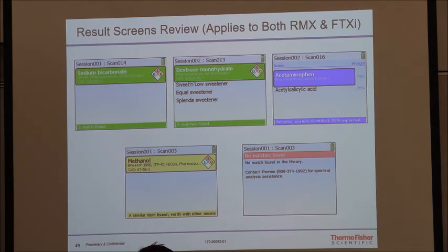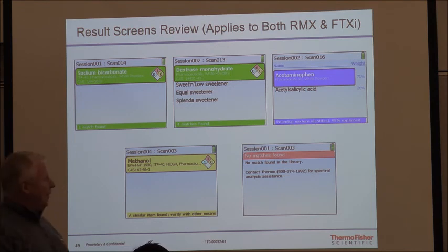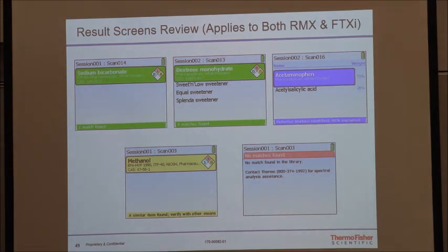Someone says, well, what's the concentration? Don't know. Don't really care. I just know it's a mix of those chemicals. Does that make sense? And I know someone's going to do it because it happens all the time. A month from now, you're going to go down range and say, hey, look at that, it's 71% acetaminophen. No, it's just showing me the identification. It's an internal battle for us to have those numbers or not have them.